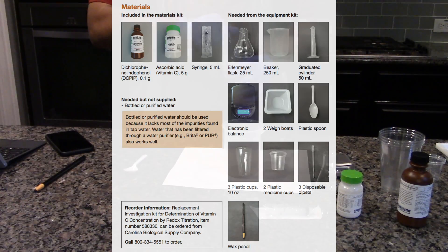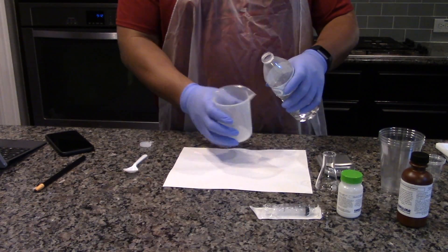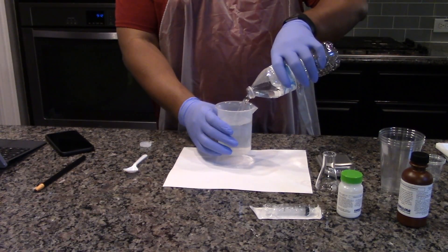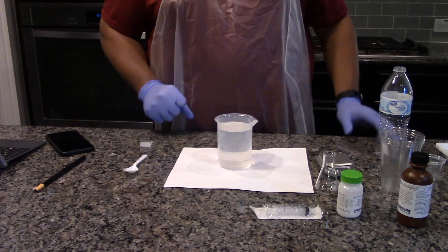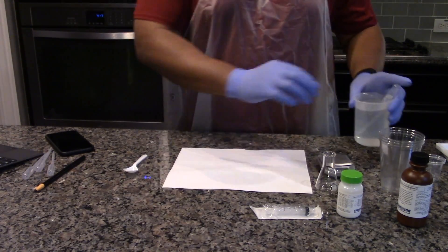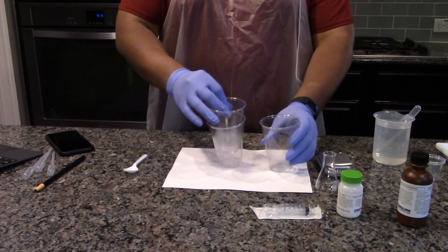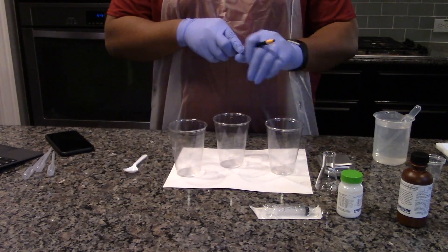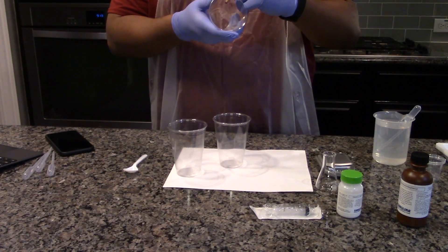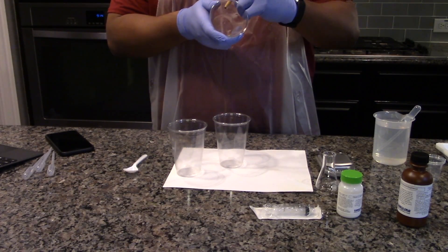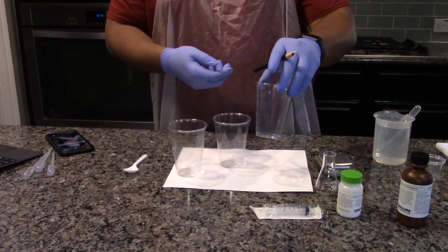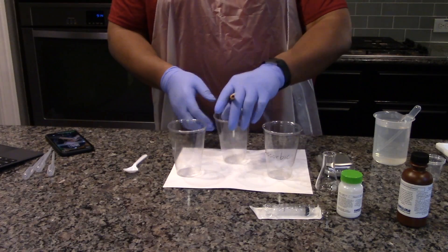Fill the 250 milliliter beaker with pure water and place a pipette with the water. Write the following labels on the three 10-ounce plastic cups: ascorbic acid, waste, and unknown.